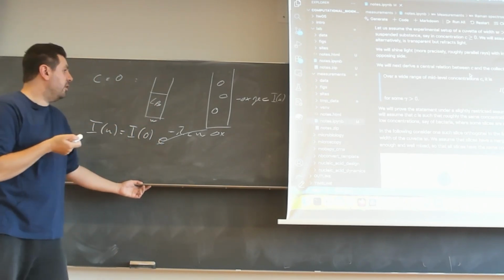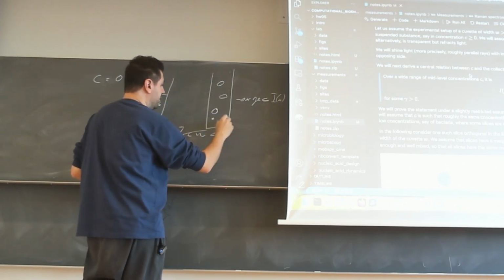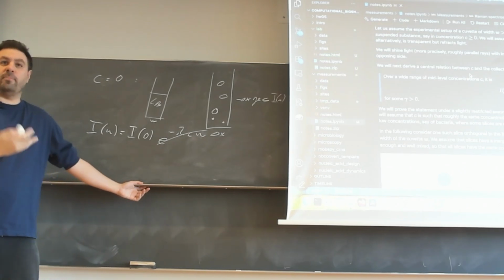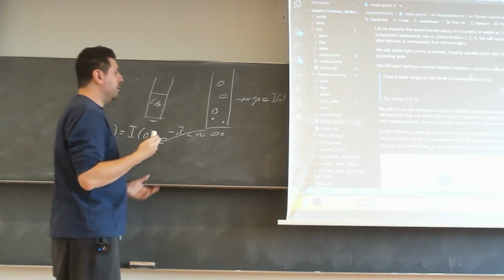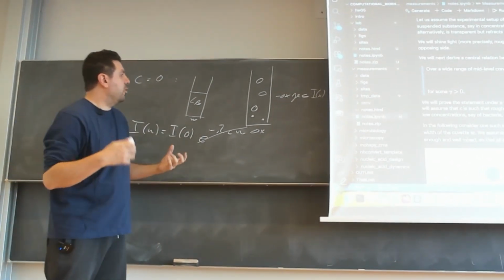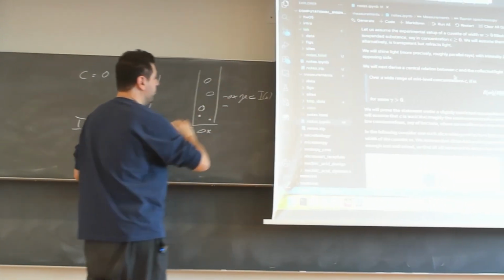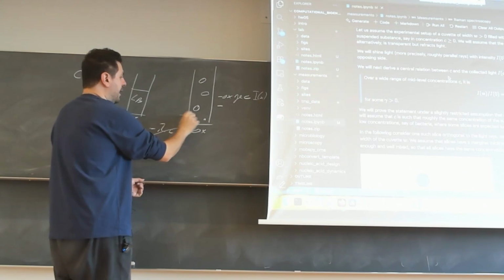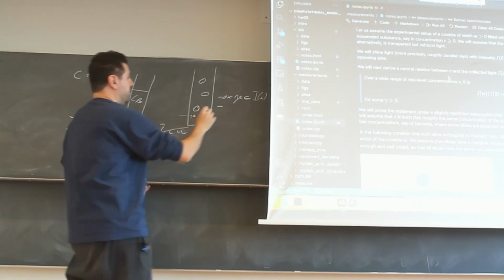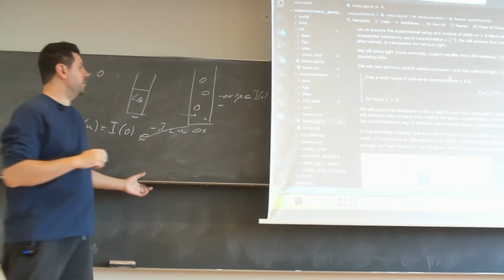So let's simplify this and say there is some LB species. Of course, this is a simplification. There is no real LB species. LB is a mixture of many things. But we can assume that there is a homogeneous, very fine-grained thing that is also removing light. Like when light hits these particles here, they're symbolic particles, not real particles. Or there are real particles inside, but they are not homogeneous. But we assume them to be homogeneous for the moment.